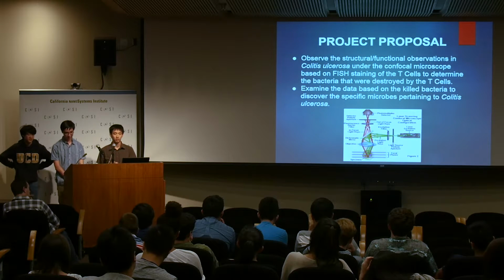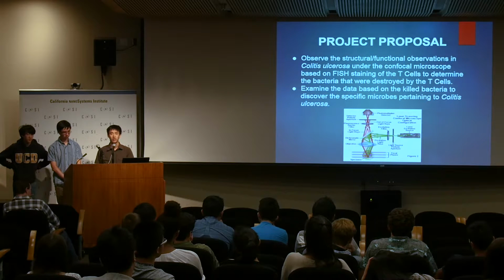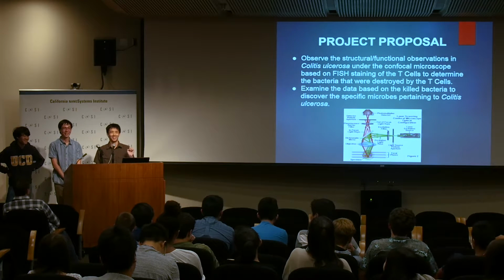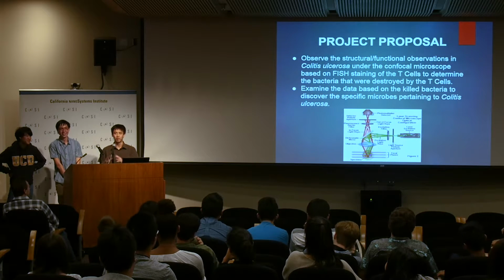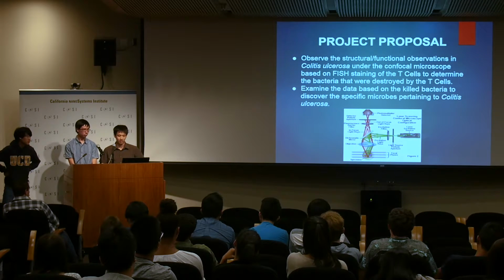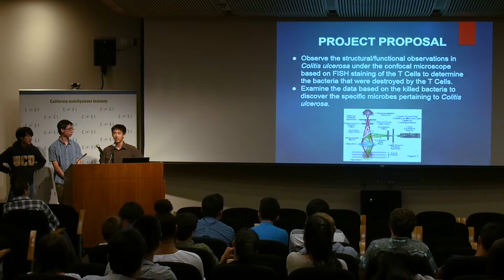In one study done by the American Society for Microbiology, they tried to observe the different microbes within the mucosal surfaces of the gastrointestinal tract. By doing this, they were able to use confocal laser microscopy, which allows a determination of the cells within, because with confocal microscopy they use a staining called FISH, which stands for fluorescence in situ hybridization.